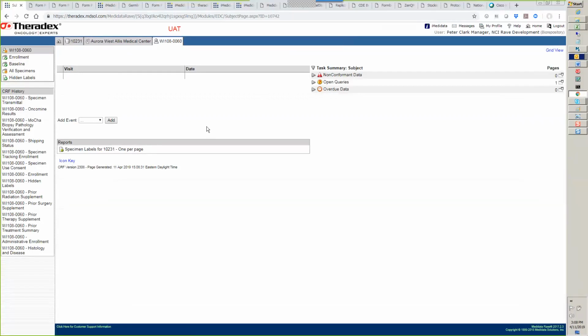The phone call that I have coming up here is all about that. So we're still working on it, and eventually the samples will have barcodes on them. That's the sample label part, right? Yeah. Okay, that'd be good, actually.